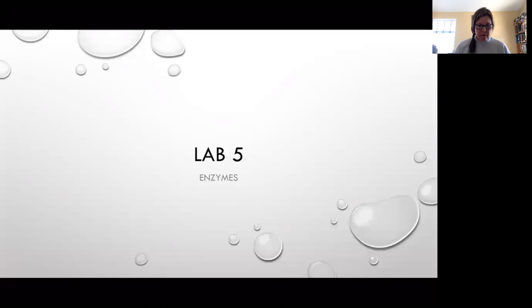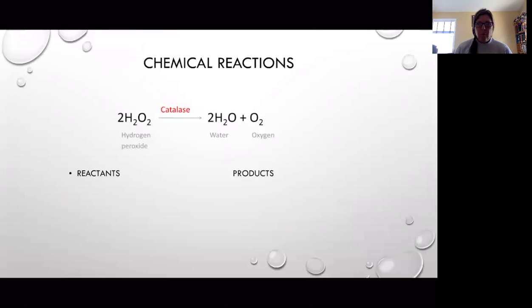All right. So, lab 5, enzymes. Hopefully, you've gotten through the chapter 5 content on enzymes, which will help you understand this material much better. So, when we look at this, we're going to be looking at catalase. Catalase is an enzyme we find in potatoes.